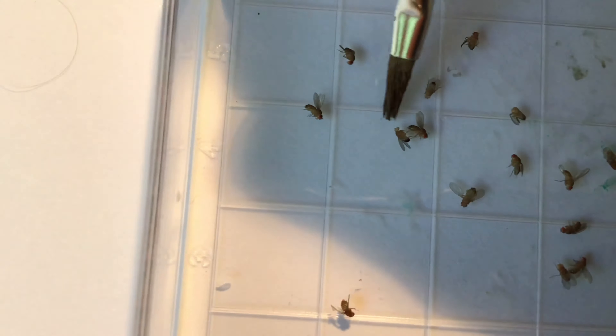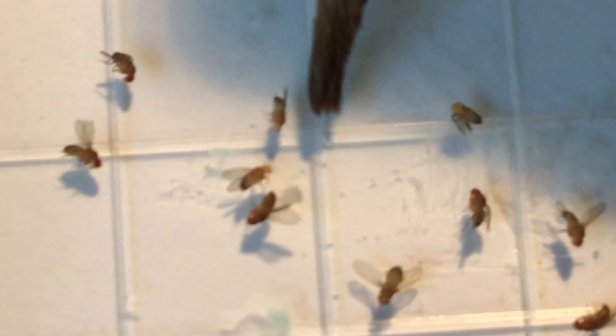Remember that male flies can be recognized because they have a thick black band on their abdomen. I hope you'll agree with me that this fly here is a male, and this male fly has white eyes. This fly here is a female — note the banding pattern on her abdomen.